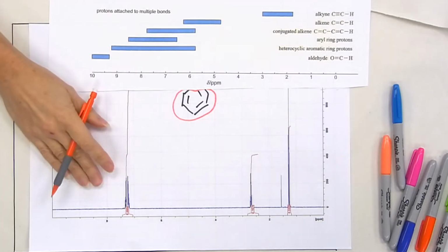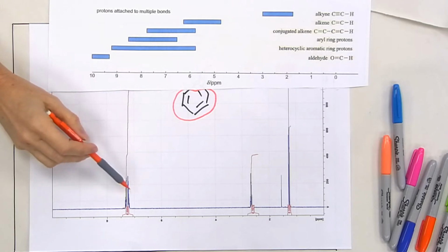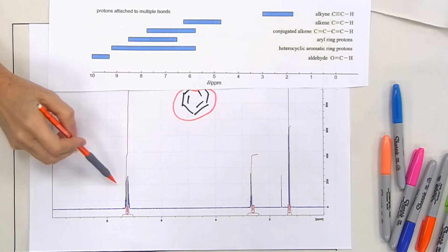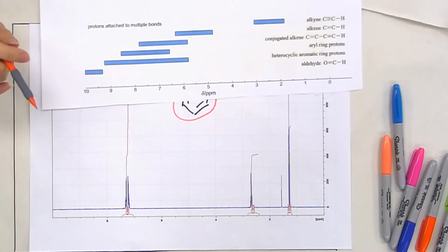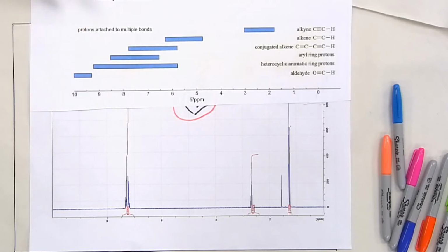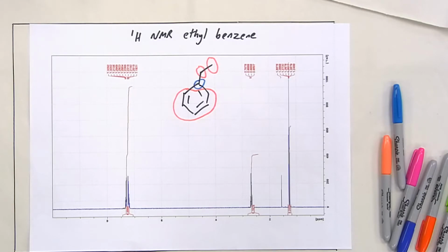Okay, so we can attribute these to the aromatics, and you can see here quite clearly that you can't really resolve it very well. There's a whole bunch of peaks, particularly at this magnification, so it's quite hard to attribute anything more precisely. Okay, right, so I'm going to swap correlation charts now. So with proton, we have a lot more correlation charts. So I think the next one we're going to look at is for the methylene.